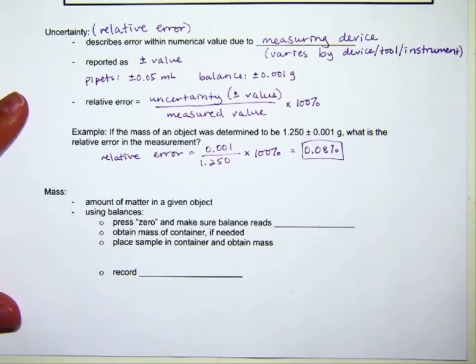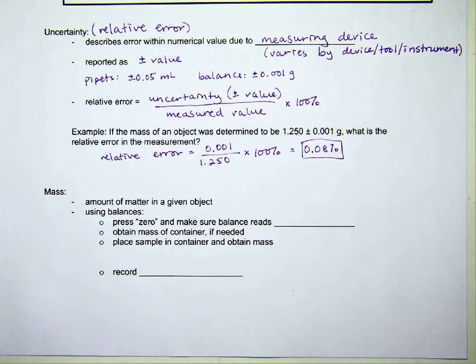Okay, so then we want to think about now the individual measurements that we're taking in this experiment. In this experiment, we're thinking about the mass, we're thinking about the volume. Those are measurements that we'll be taking, and we'll be using those measurements to understand the density. So to calculate the density and then use the density to identify our objects.